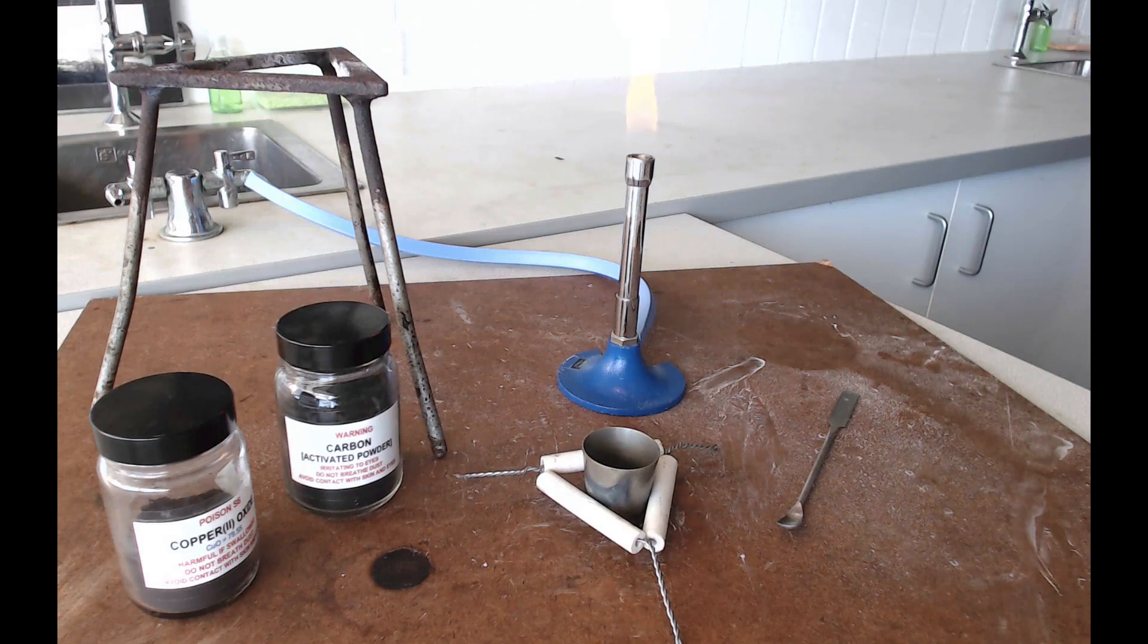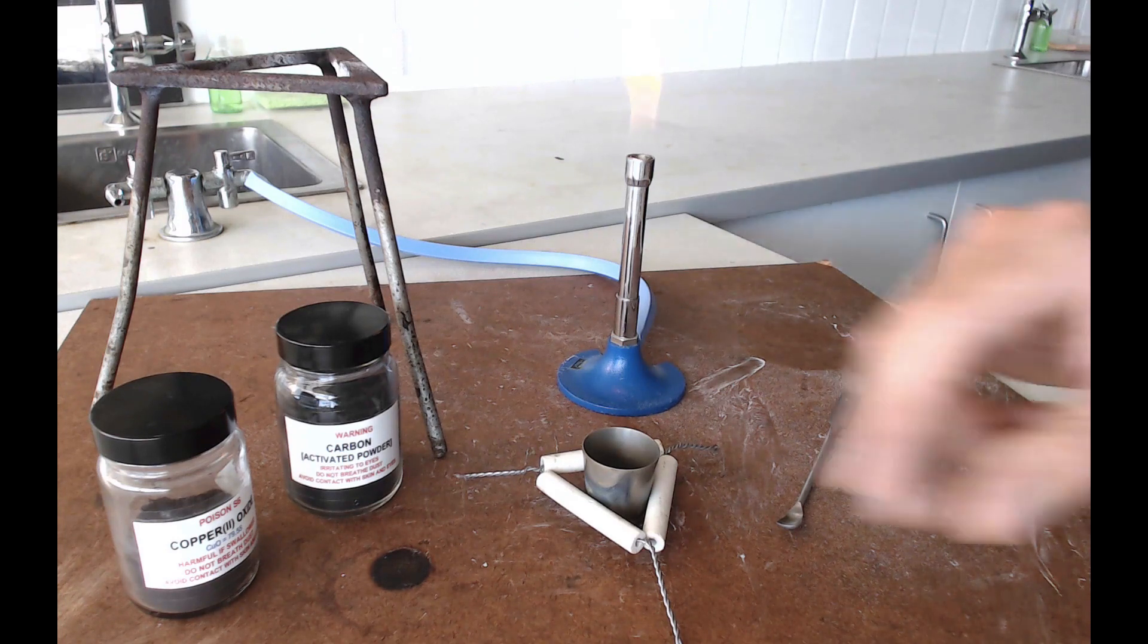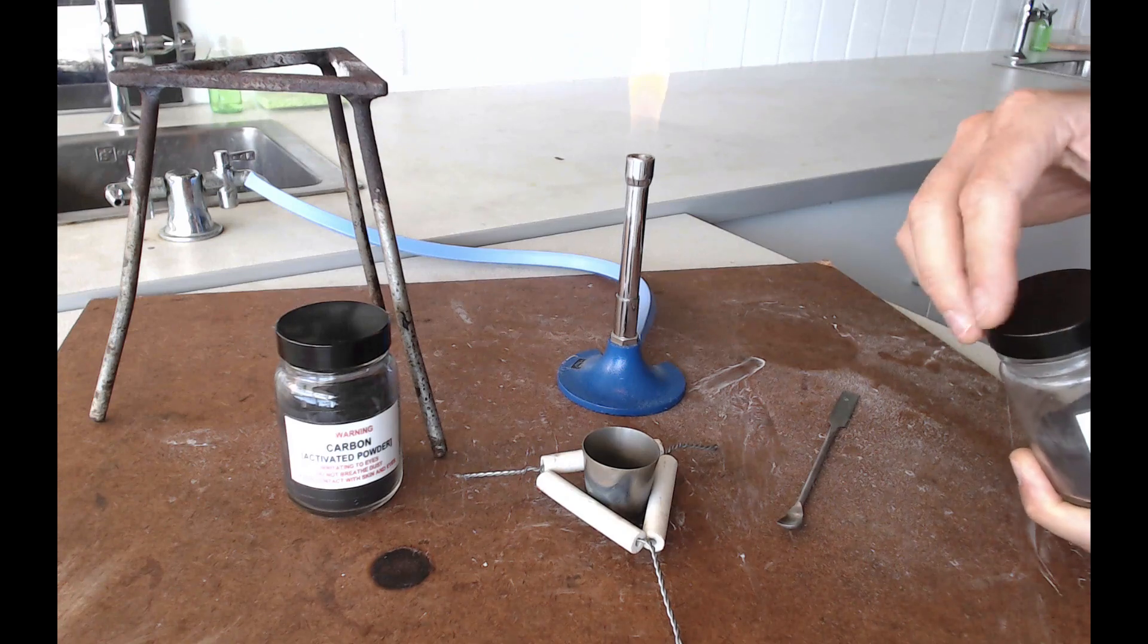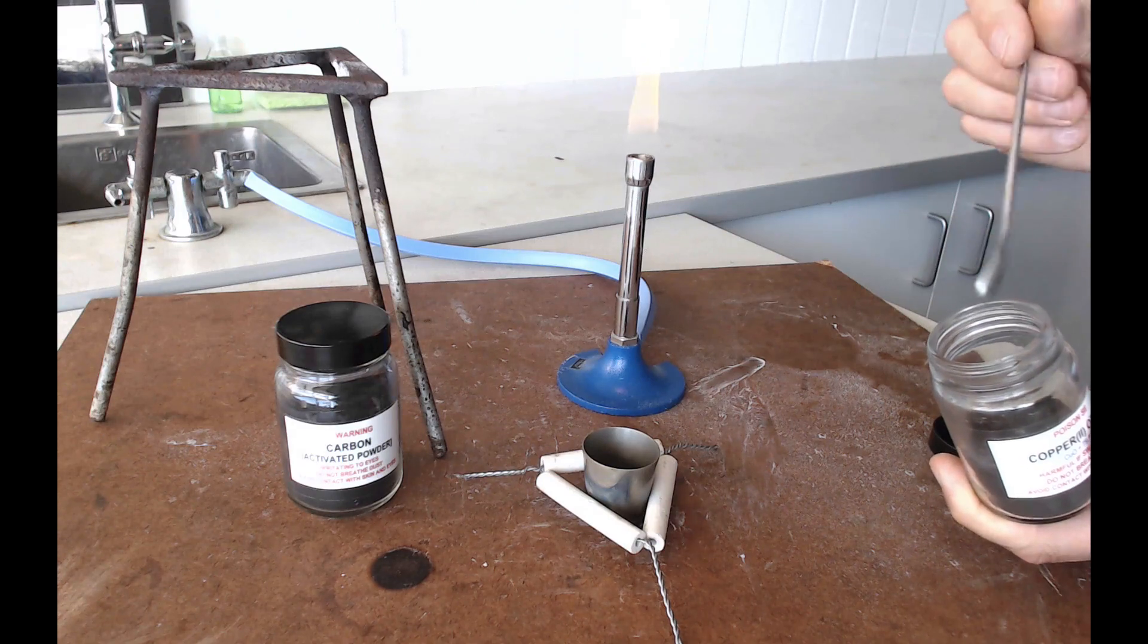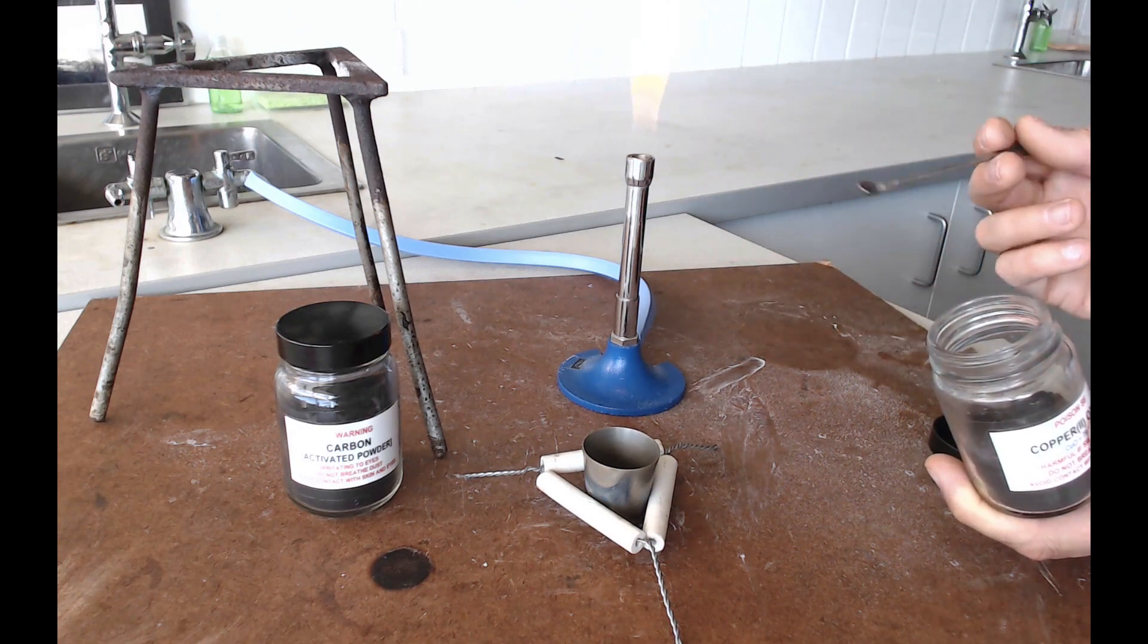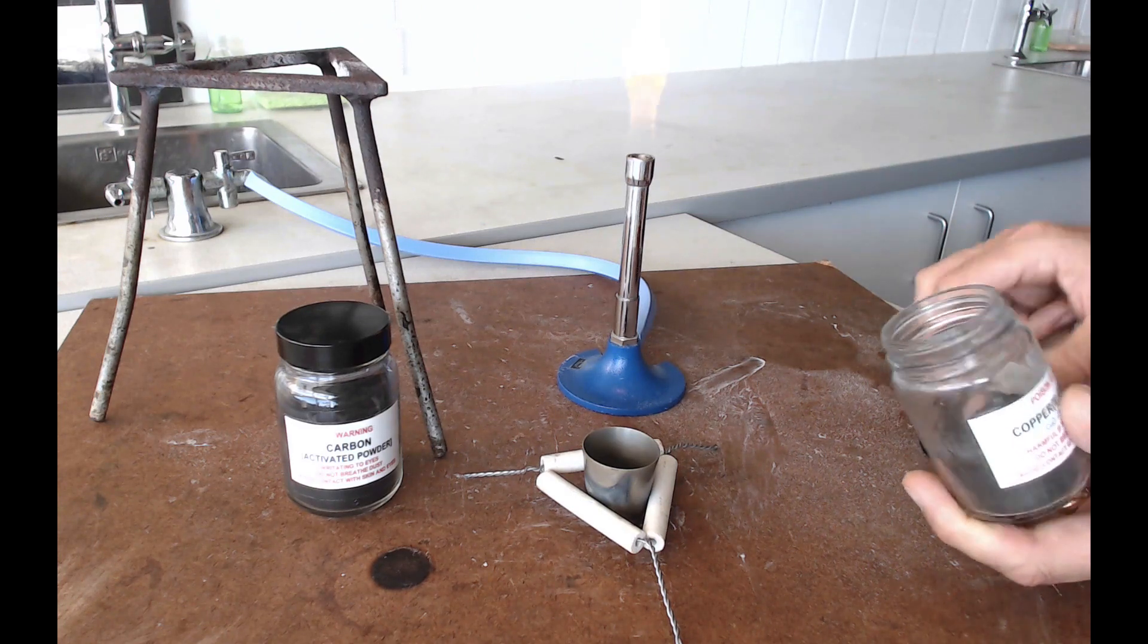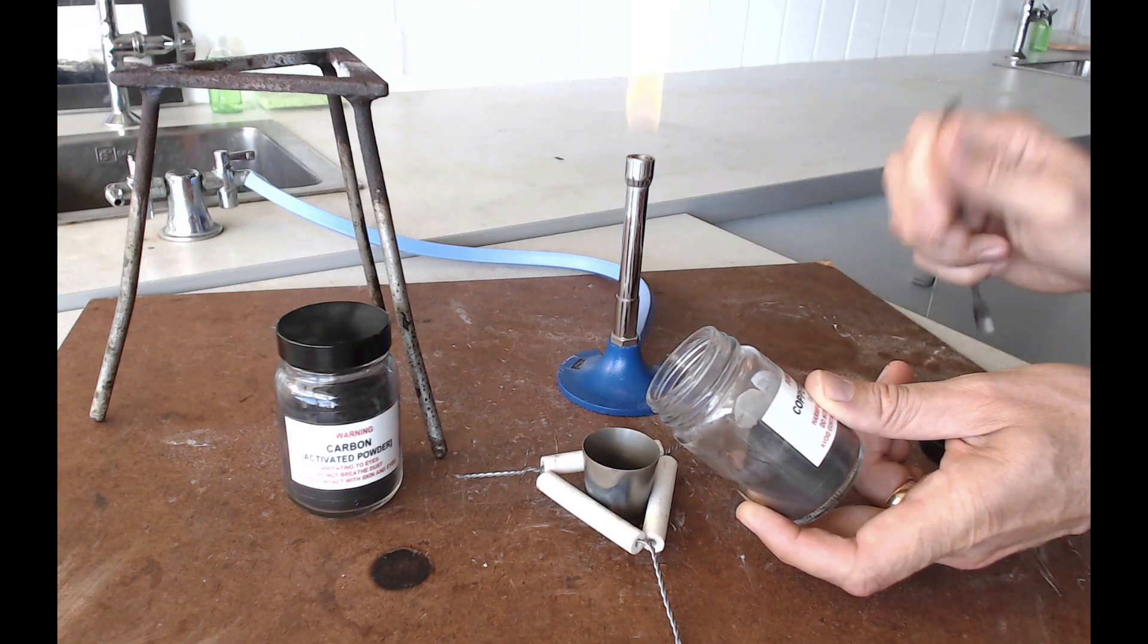Now the first thing you need to do is put roughly equal amounts of these two powders into your crucible. Be a little bit careful when you're doing this. If you're transferring the solid from a jar which is far away from the crucible then you're likely to spill some of it and these solids are quite annoying to have to tidy up afterwards because they make quite a mess and they're quite difficult to clean up. So try and make sure that your jar is nice and close to the crucible because then if something falls off your spatula it's likely to fall into your crucible.